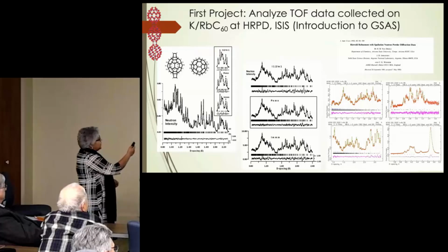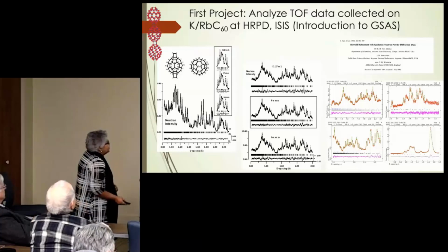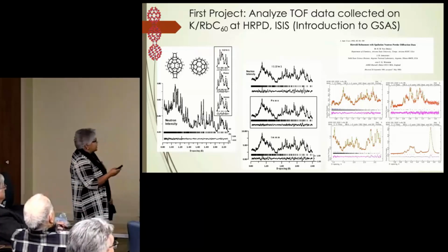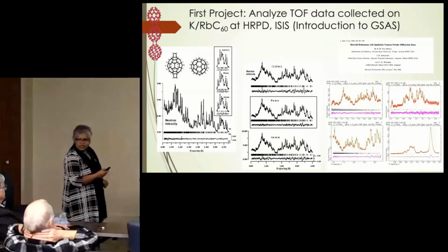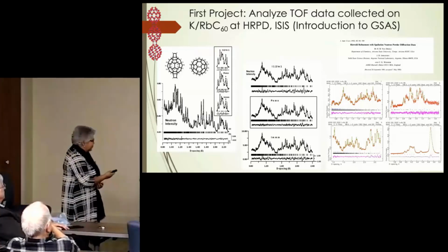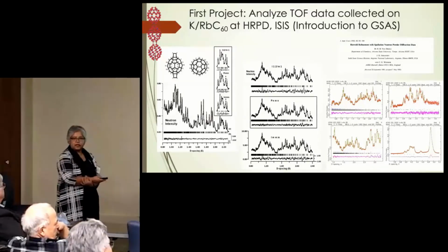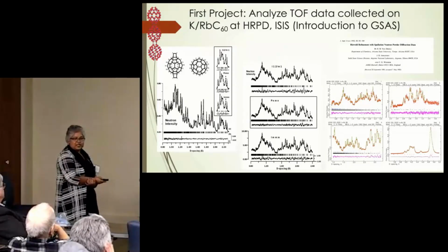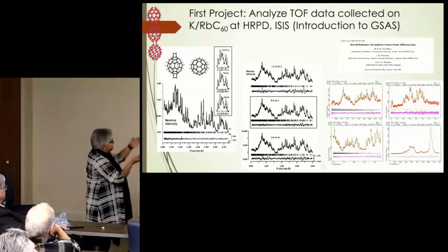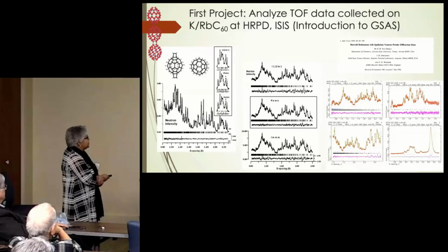So this paper has been shown by a couple of people, Von Dreele, Jorgensen, and Windsor from ISIS, or maybe it wasn't ISIS at that point, it was Harwell, right? It was Harwell. Yeah, okay. So I read that paper very carefully. It flew well over my head at that point, but I said, okay, let's go figure out the software. And I kind of muddled my way through and figured out which were the correct space groups for these materials. These are polymers.